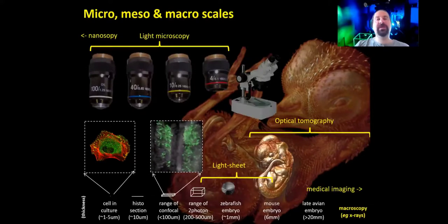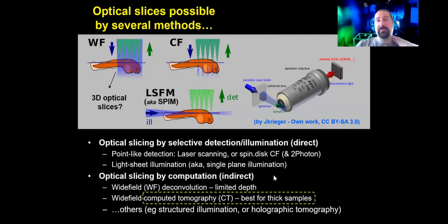Now, I've already alluded to the fact that we're talking typically about three-dimensional imaging using optical slicing, as you normally use it, for example, in confocal microscopy. The paradigm for three-dimensional imaging in medical fields and even in optical microscopy is still pretty much that you image and handle images of large volumes as a series of optical sections. This is known generically as tomography. The word tomography is more common in medical imaging and not so much in optical microscopy, but in fact, confocal microscopy and light sheet microscopy are a form of tomography.